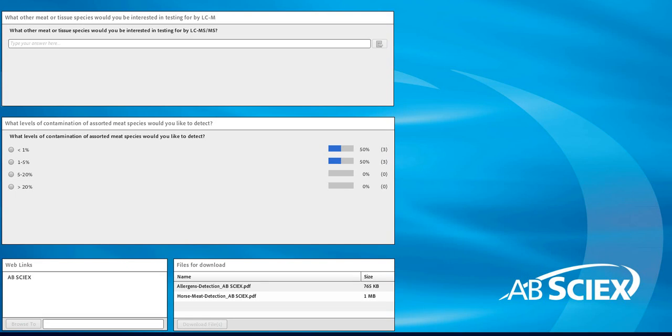As we broadcast the results, for the levels of contamination, we can see that anywhere between 1 to 5%, or less than 1%, are the concentrations you would be looking to detect for assorted meat species. And when we look at the other answers for what other meat or tissue species you would be interested in, we see some comments on pork, beef, halal meat, and we also see seafood products, shrimp or prawn, for people who have allergies. So Steve, do you have any comments on those results?